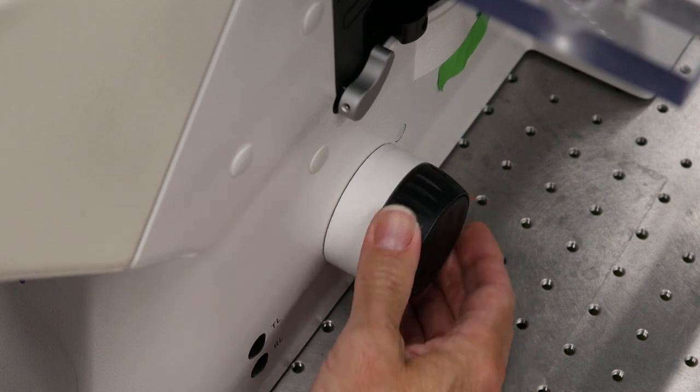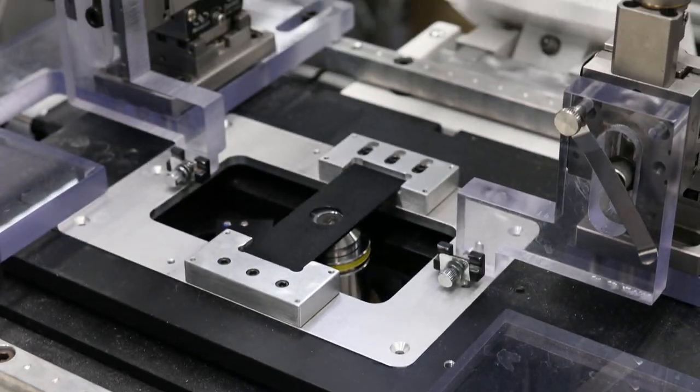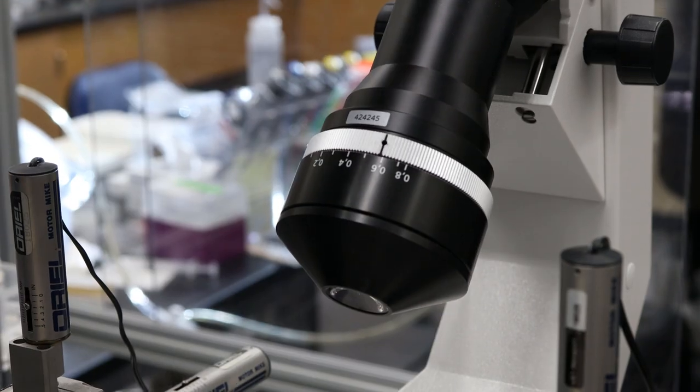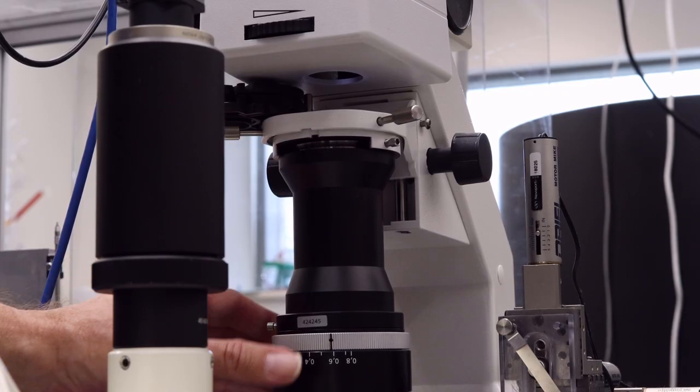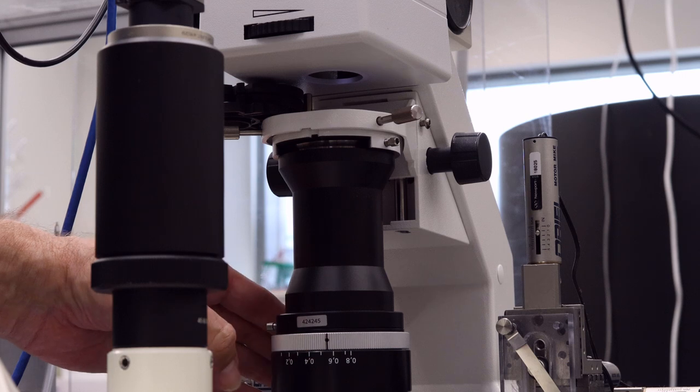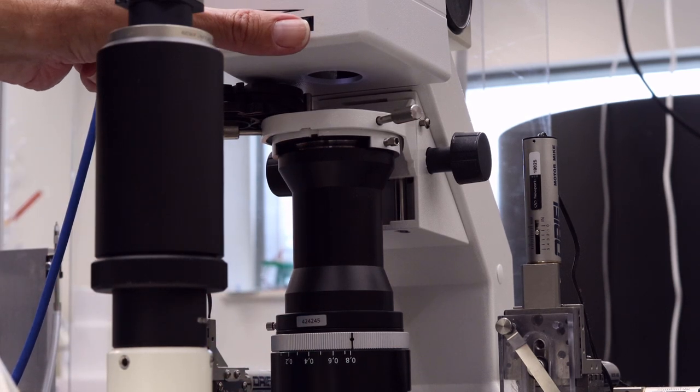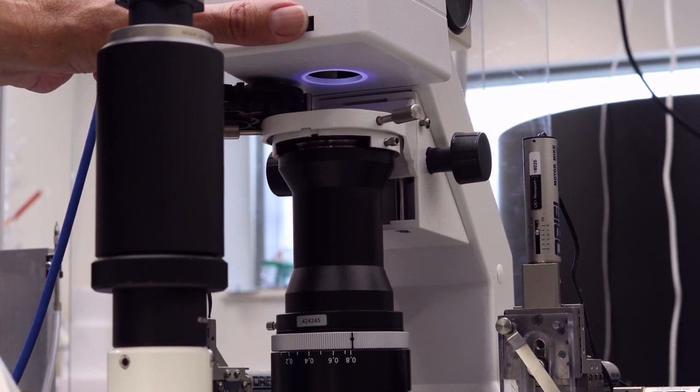Next, we raise the objective, lower the condenser, and adjust the two diaphragms so that we get enough light in the eyepieces to start looking for our specimen. Here I am opening both the condenser aperture and then the field stop all the way.